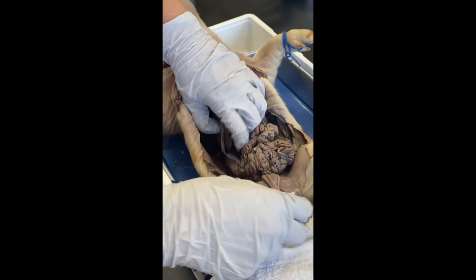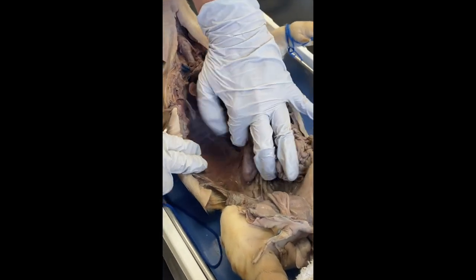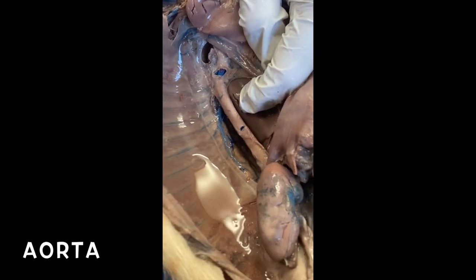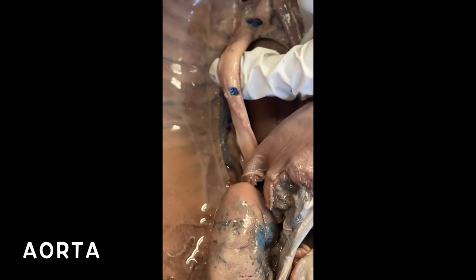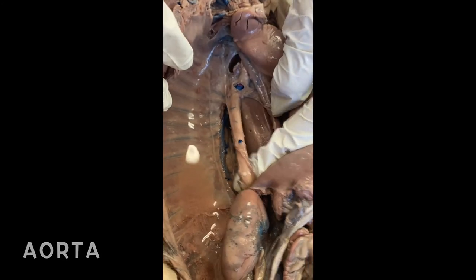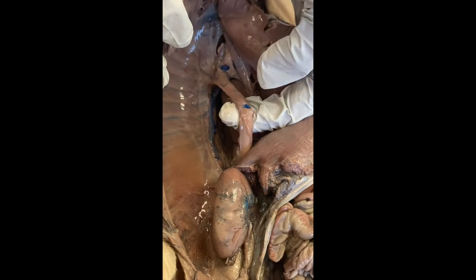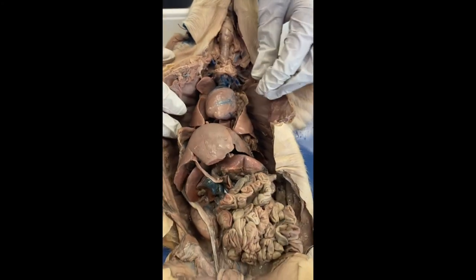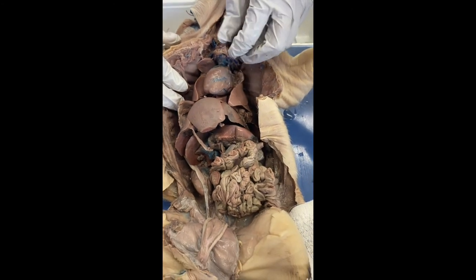And if we go to the back, this is the part that to me is kind of a wow factor. It's this major blood freeway, the aorta, that takes all of your blood from your heart all the way down and supplies it to your organs down here in your abdomen. That's pretty major, and it's here in the back of the pig that runs down. And that'll wrap it up for cardiovascular and respiratory.